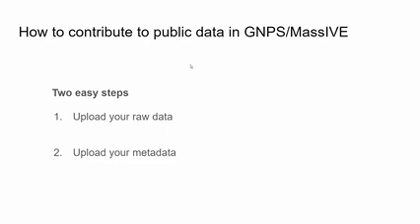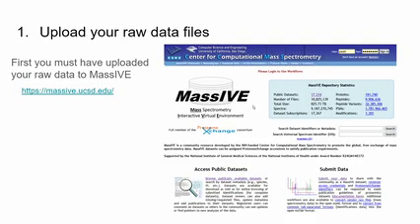The main reason I put it here into the slides is because I want you to know how to do it. You have access to the slides, and I want you to have some basically step-by-step click through how you can do that. That's not really a hands-on thing now. I just want you to have this material to then refer to if you're trying to upload your own raw data. I will just rather quickly go through it.